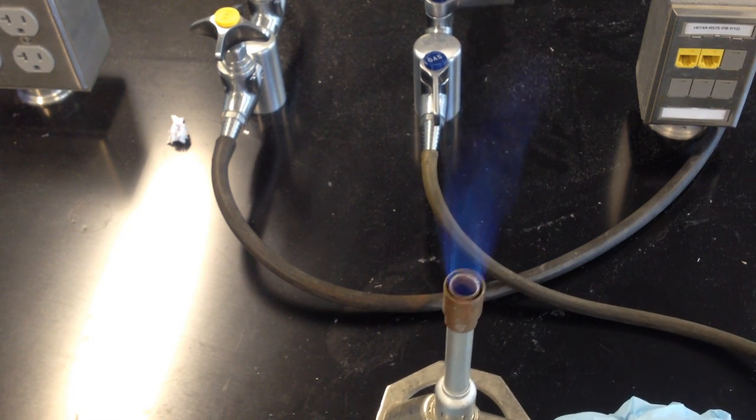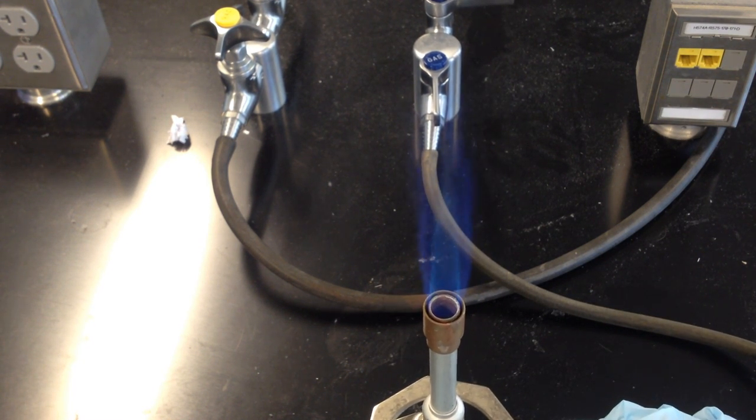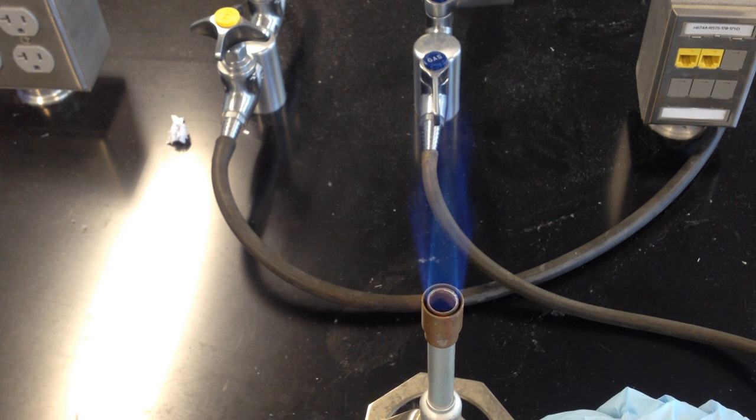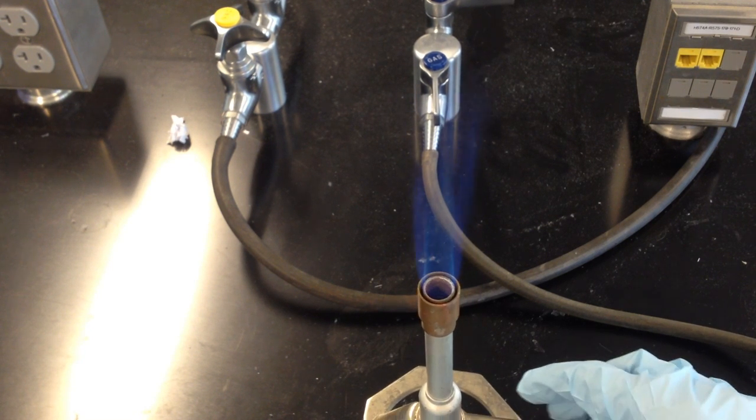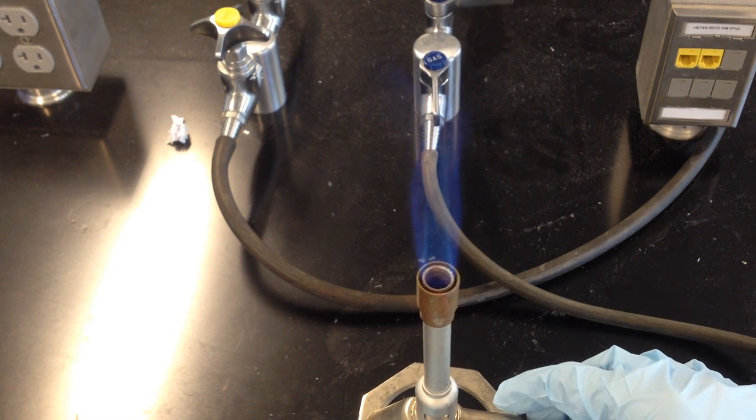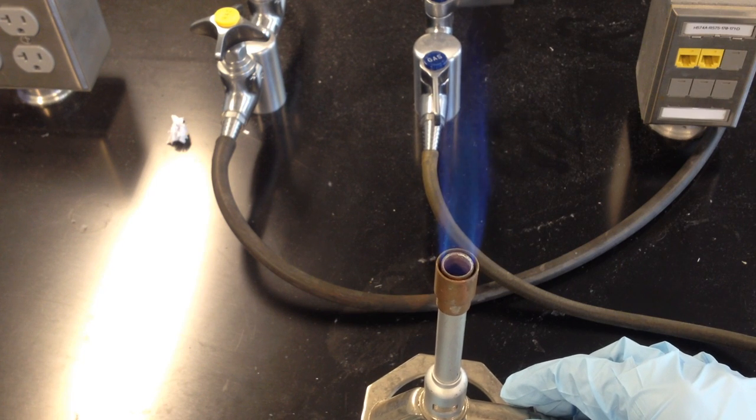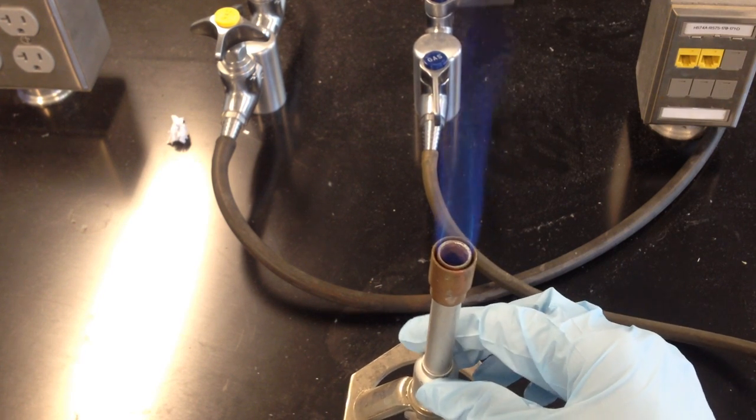Now, what you're looking for in the flame is two distinct parts. You'll notice a blue outer flame and a lighter blue inner flame. That inner cone is the hottest part of the flame, and so you want to make sure that inner cone is very clear.